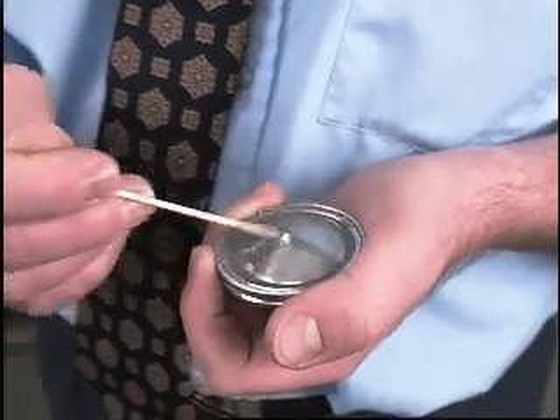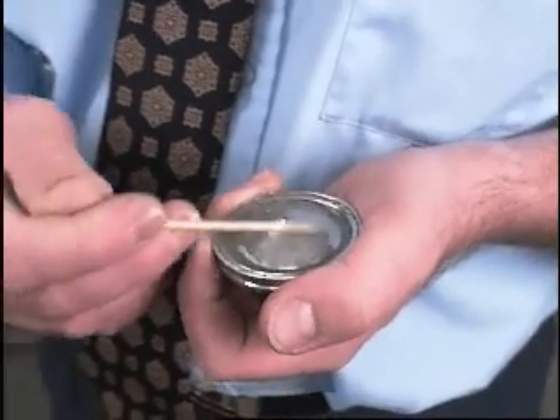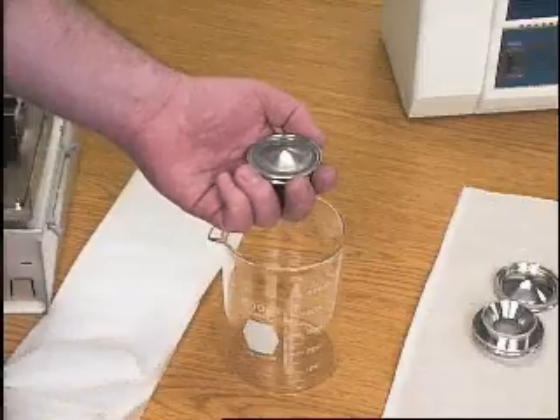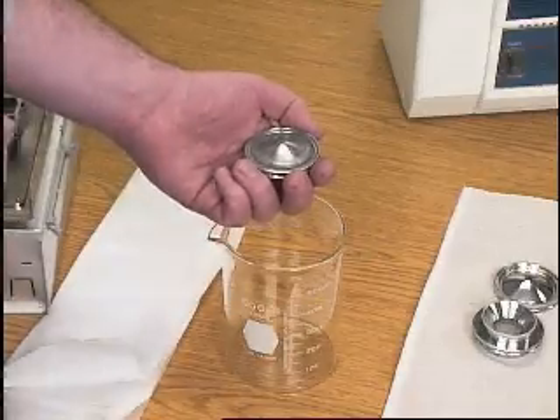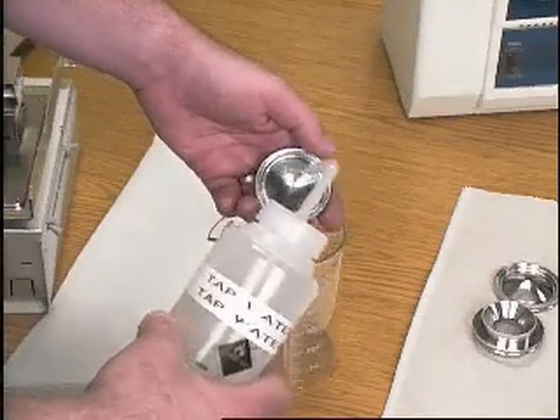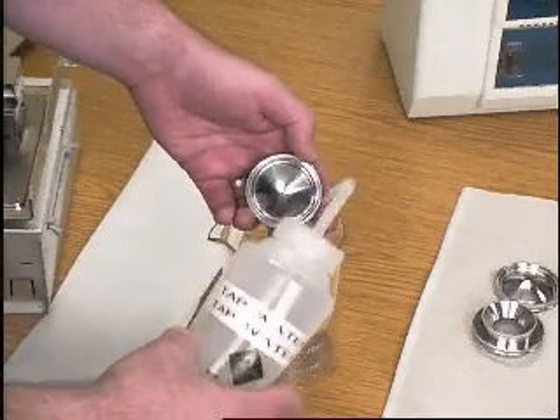Do not let the slurry dry on the metal — dried aluminum oxide is very difficult to remove. After you clean a part, hold it under running water and use a clean applicator if necessary to remove all traces of aluminum oxide.